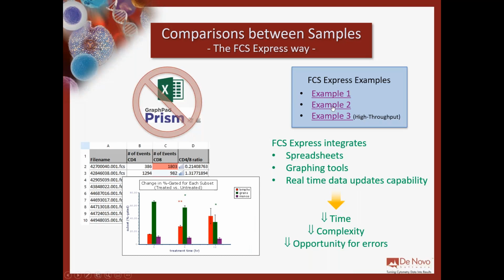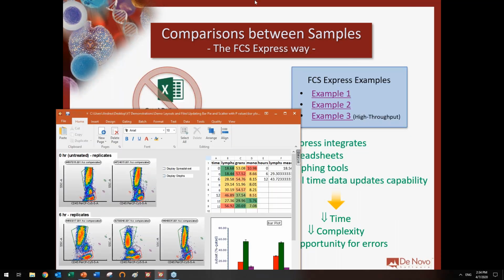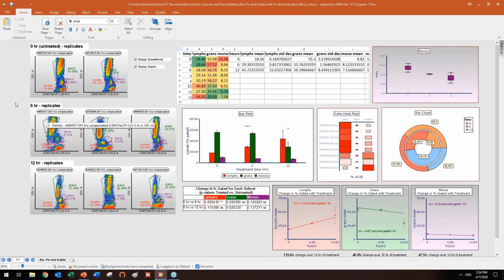And this is why I put together this second example, which is more, let's say, real life. Again, I imagine to have three experimental groups, but actually you can have as many samples as you want, as many groups as you want. They can be organized as you want, multiple pages, single pages, it doesn't matter. In this case, I have 2 samples for group 1, three samples for group 2, three samples for group 3. Again, you retrieve statistics, but then you want to create some charts, you want to calculate some statistics because you want to compare group 1, group 2, and group 3.